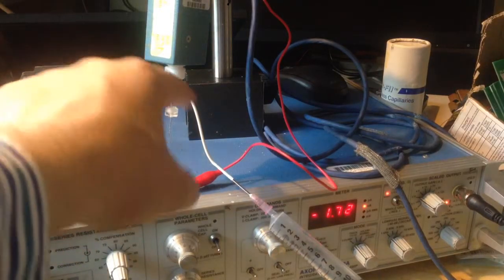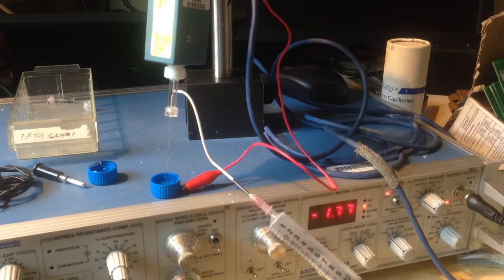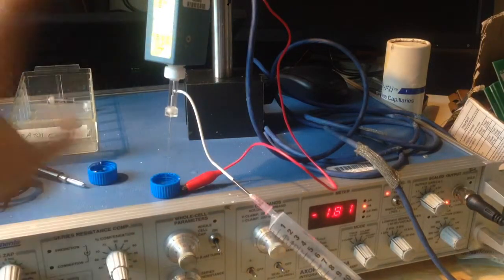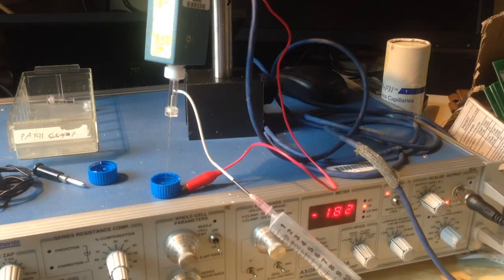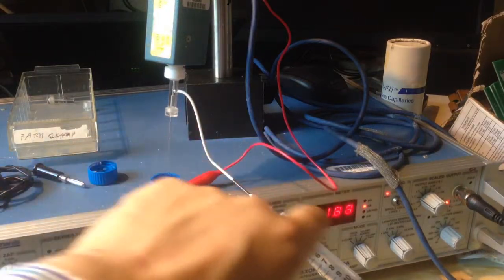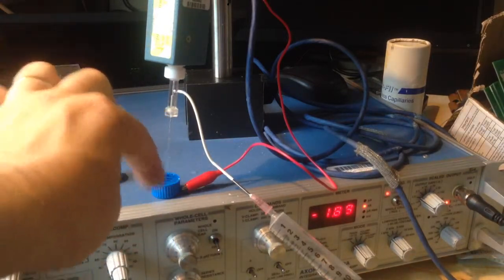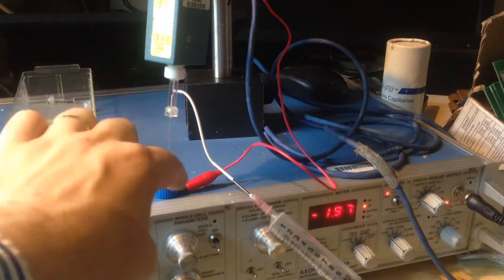I didn't have the right tubing to go from the patch clamp to the syringe. So this is a bit of silicon tubing for some wire. I pulled off a piece of wire, so it's all very bodged together, and obviously the solution is just sitting in a cap. So basically what happens is a voltage gets put across this solution. This is the ground terminal that's coming in, this red wire, confusingly, that is going just into the bath, as they call it, into the solution. And then the micropipette is sitting in that solution as well.